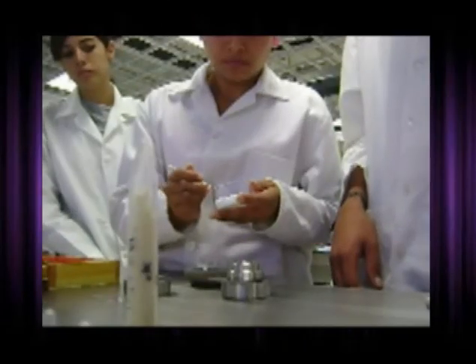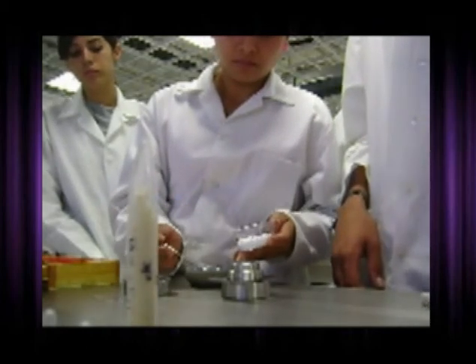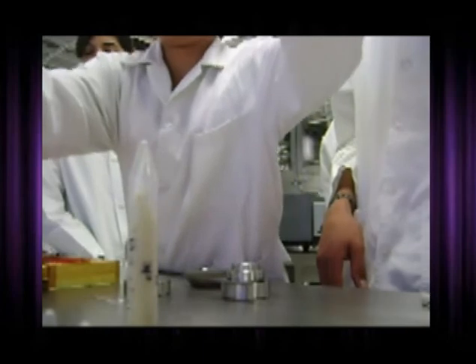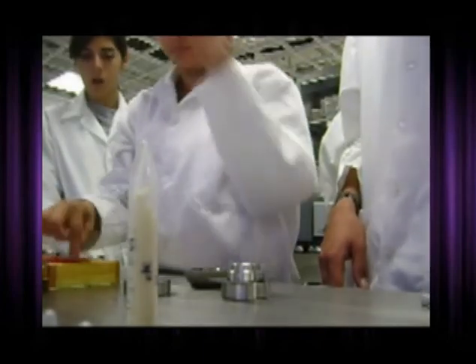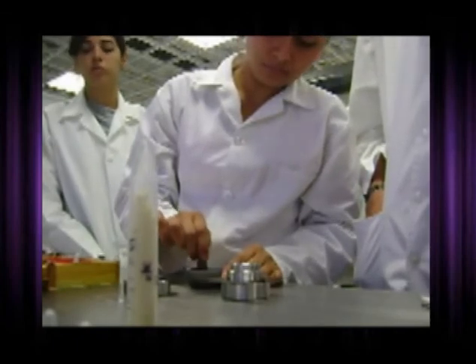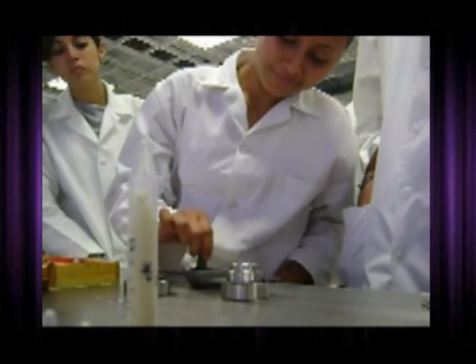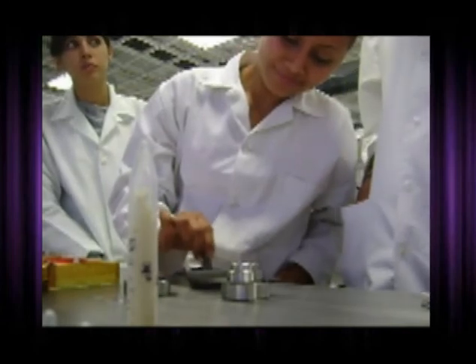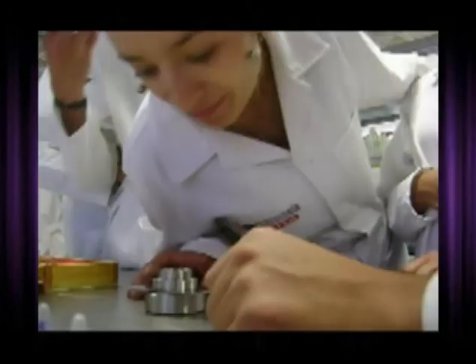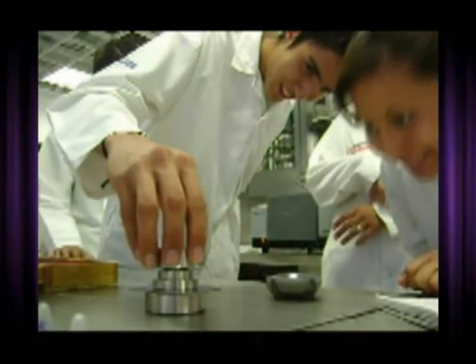The method is to grind a quantity of the sample with a special purified salt. In this case, we use potassium bromide. This sample is mixed with potassium bromide in an agate mortar, in a 1:10 proportion. We use an agate mortar and not porcelain because of the ability to control the grind and also to virtually eliminate contamination from the mortar and pestle set itself. This is probably the most ancient device one is likely to find in a modern scientific laboratory, and with this we look for a homogeneous blend between the sample and potassium bromide.